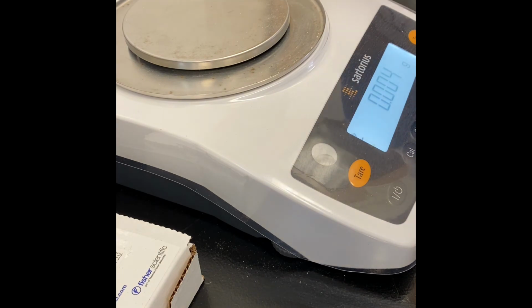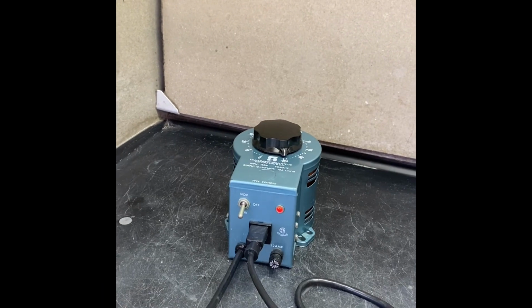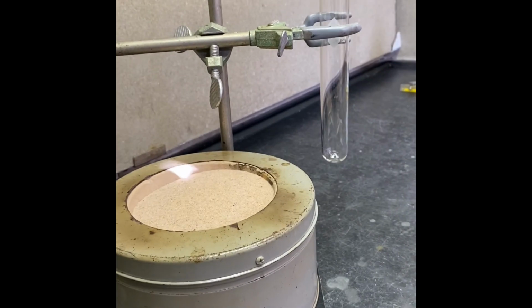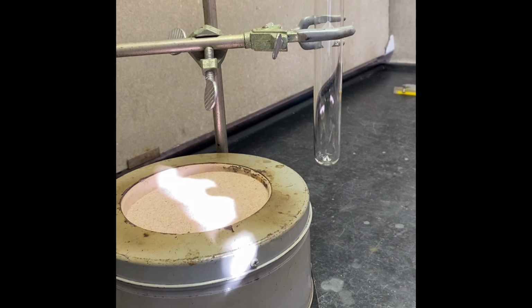Hello everyone, today we're gonna do Diels-Alder reaction. So this is our reaction setup. We prepared our sand bath and that test tube. This is gonna be our reaction flask.